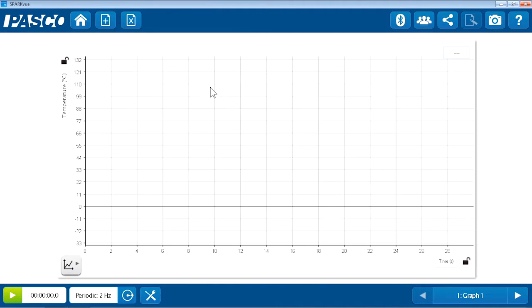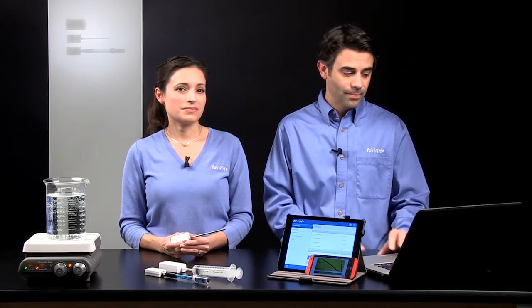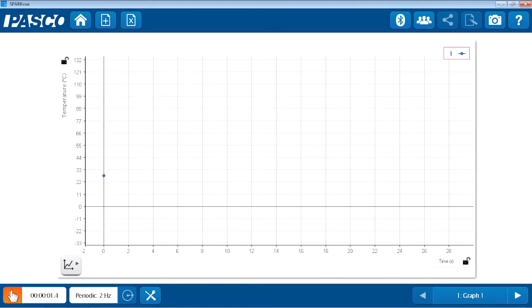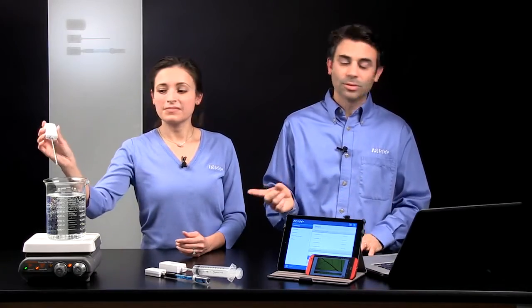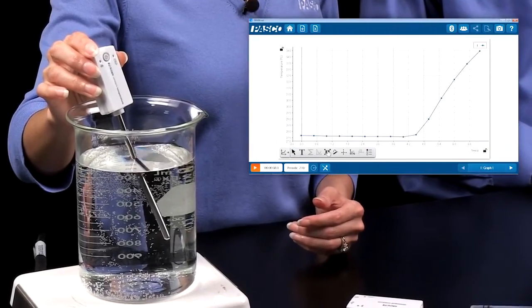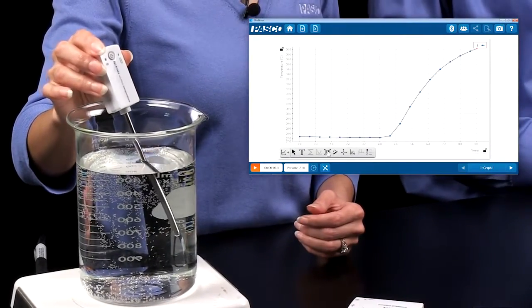So I'll touch temperature, and automatically I'm launched into a graph. And I can start collecting data. So seconds from turning it on, to pairing, and connecting, to collecting data. And a hot water bath. We can definitely see that temperature change. Yeah.